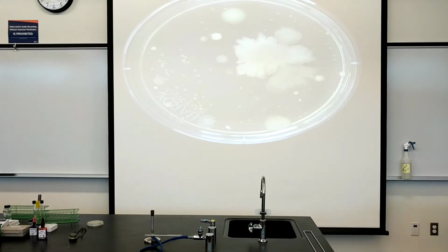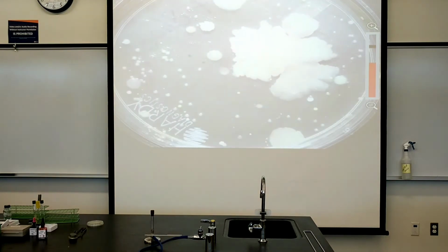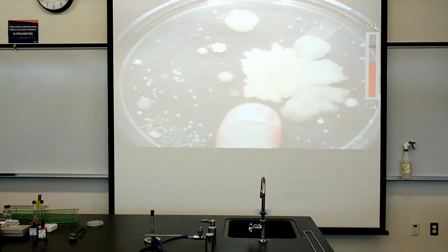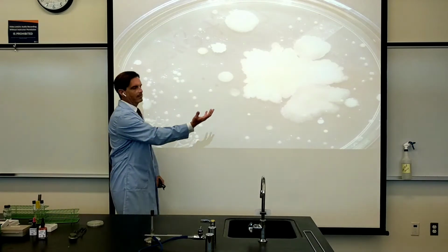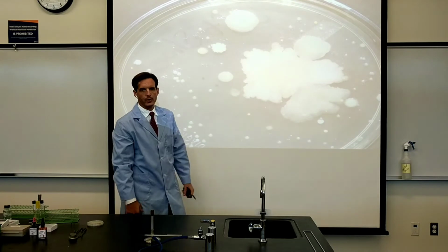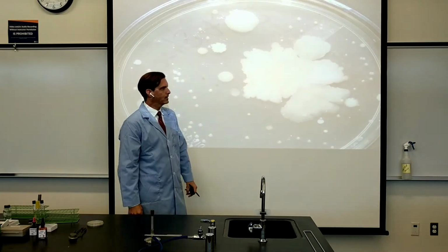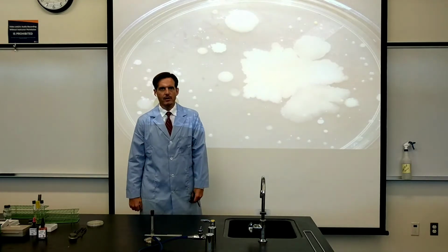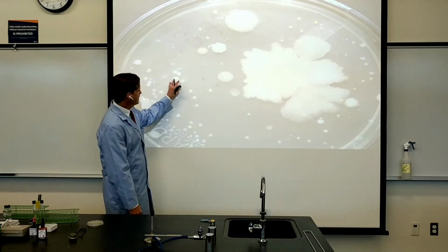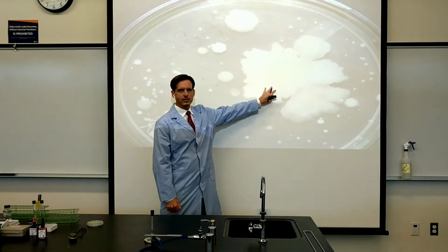So here's the plate now with a clear lid so that we can see through it. And I can zoom in even further, and I'll see if turning the light on helps. It does help a little bit. And we can really see these colonies from the top side as they are growing up from the agar nutrient jelly-like substance on the bottom and then growing up towards you. They look like usually little dome-shaped structures. Depends on what species they are and how they grow, but you can see the different colonies. Some colonies are shiny, other colonies are rough and dull looking.